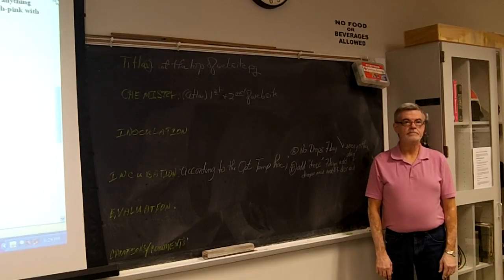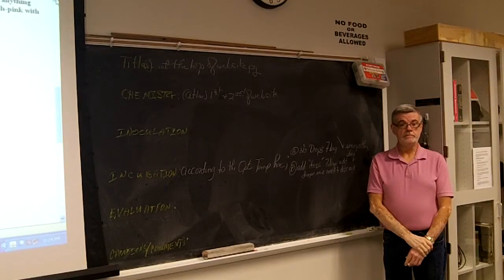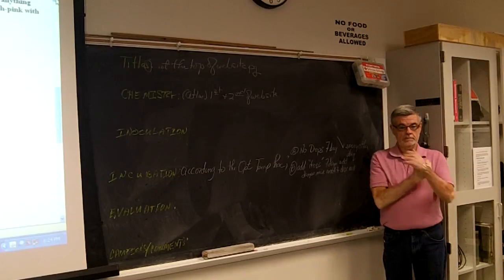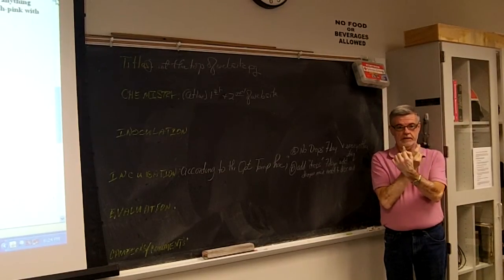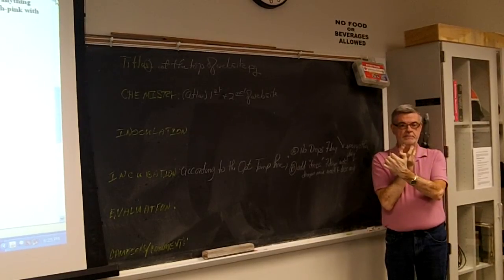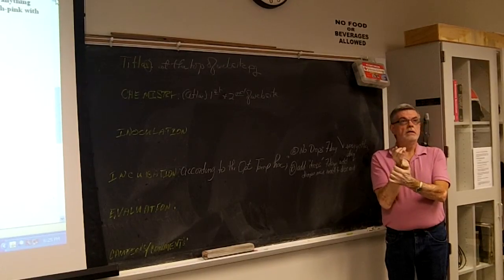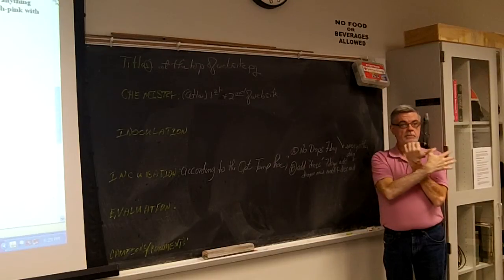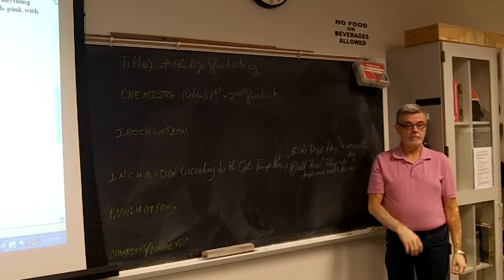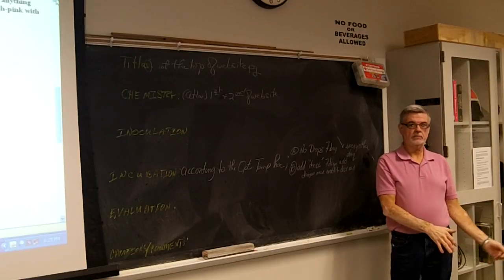I just have a question about the first part when you said your test question. There were 7. I'm just wondering what the 7th one is. Negative. You have positive with gas, positive without. Fast positive with gas, fast positive without gas. That's 2. Yeah. Moderately fast positive with gas, moderately fast positive without gas. That's 4. Slow positive with gas, slow positive without gas. That's 6. Okay. Negative is 7. Negative with nothing. You can't make gas if negative. Okay. Except alcoholic, which makes it the 8th.